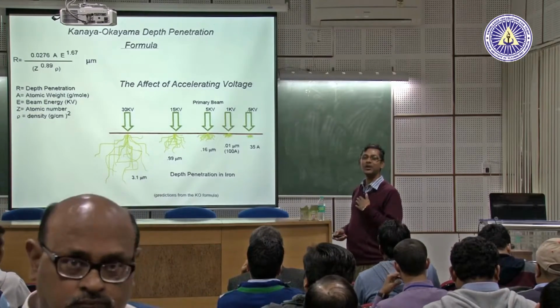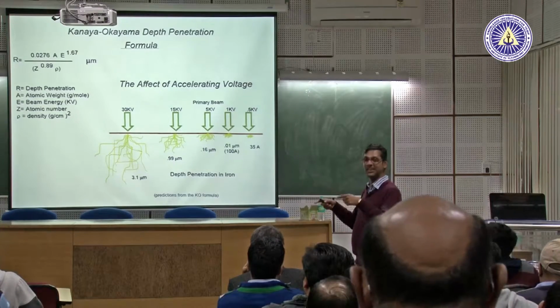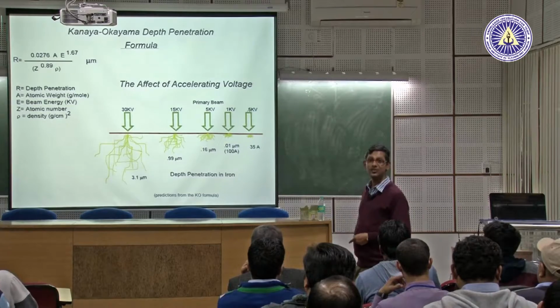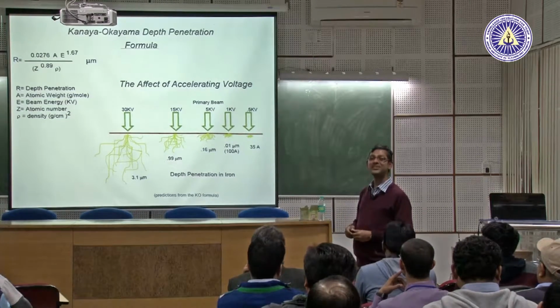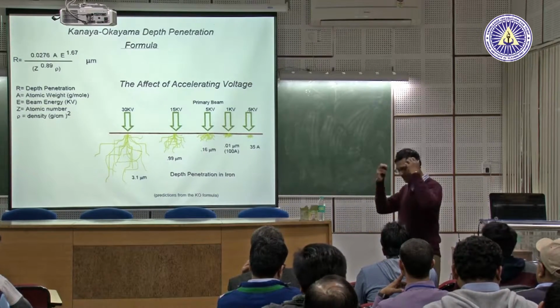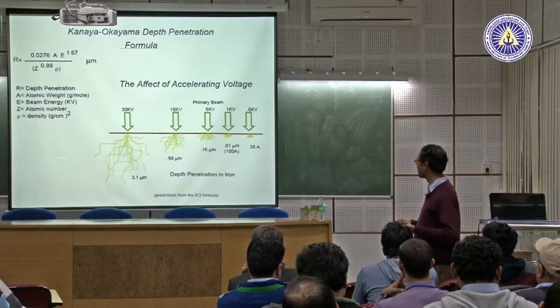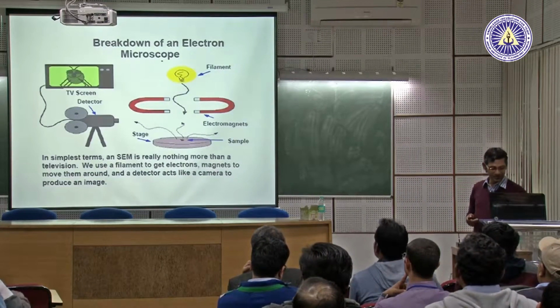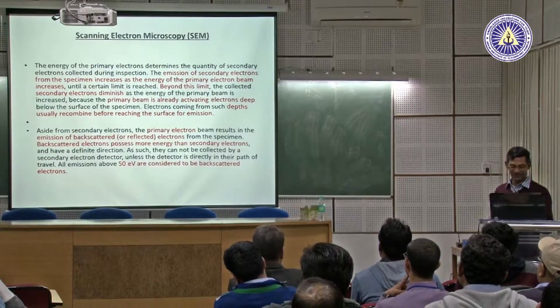That's why one of my teachers used to say that doing electron microscopy means sitting in a cold, dark room, using your hot brain to think. That is the biggest challenge our students always face. Sitting in front of a microscope, they stop their brain from working. Then they collect the data and come back, and something is wrong. So these are the things you should not forget. Okay, this is something wrong, no need. These are all the history of the electron microscope.